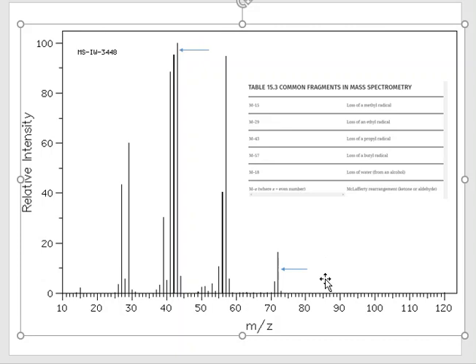The molecular ion peak is a little bit harder to distinguish. Basically, what you want to do is go to the farthest right peak on your mass spectrum, and then note that there's probably going to be a little M+1 or maybe an M+2 peak. So then look for the bigger peak just to the left of that. The one I have the arrow on over on the right is the most likely molecular ion peak. But you can see that there are still these clumps of peaks.